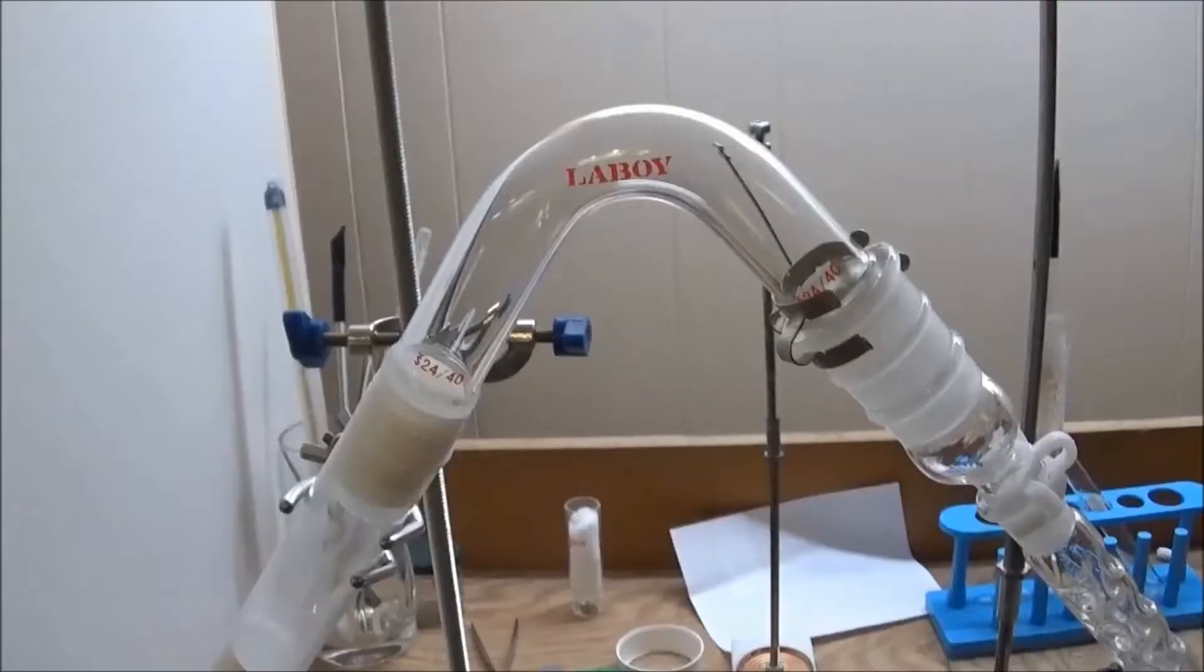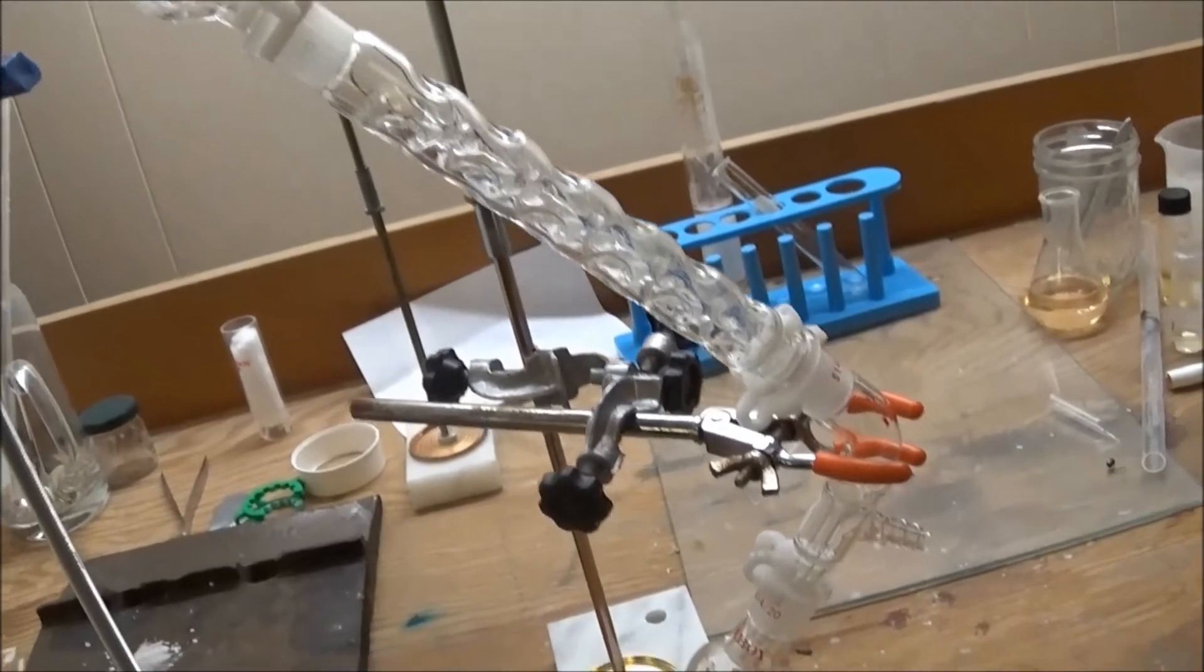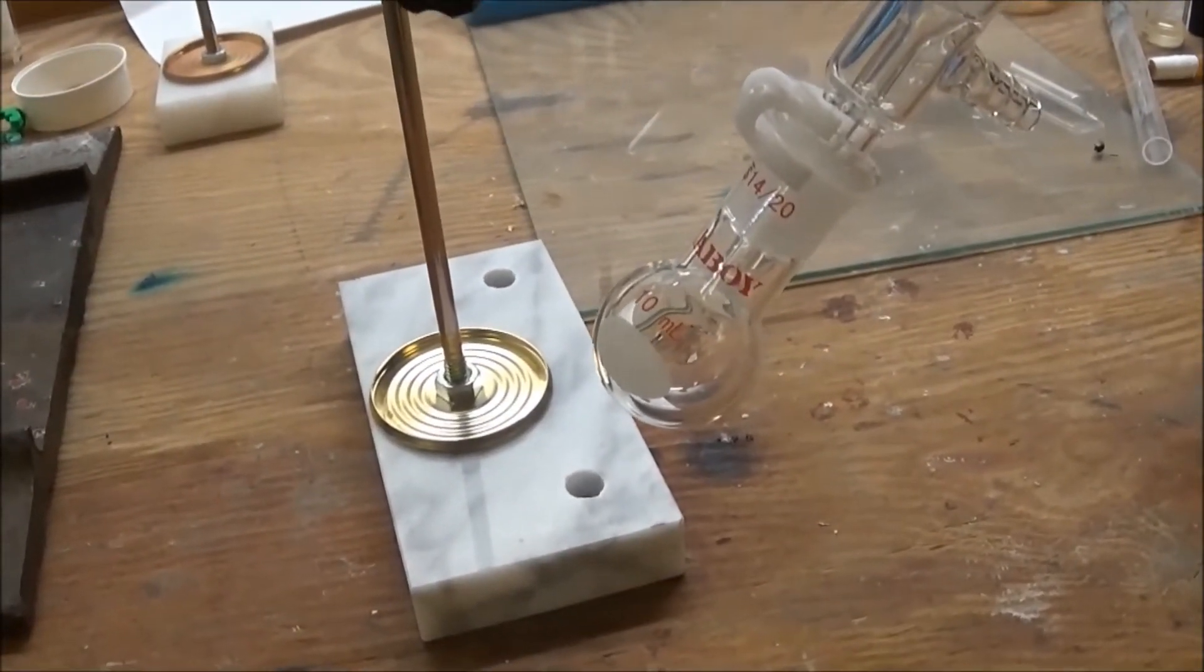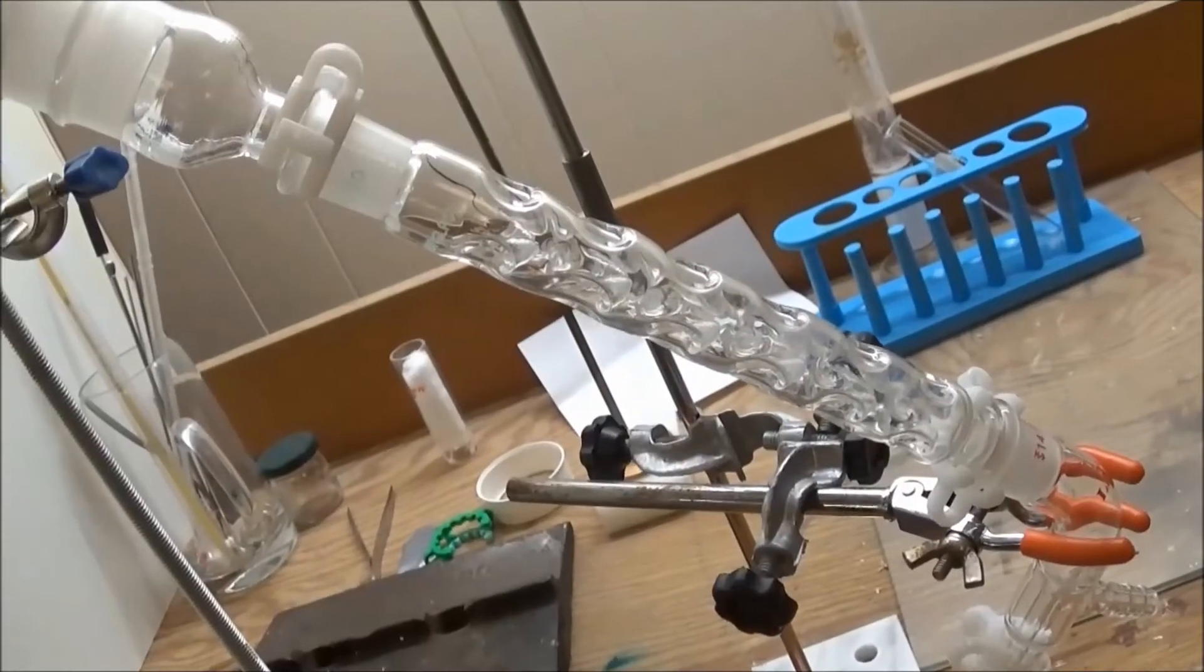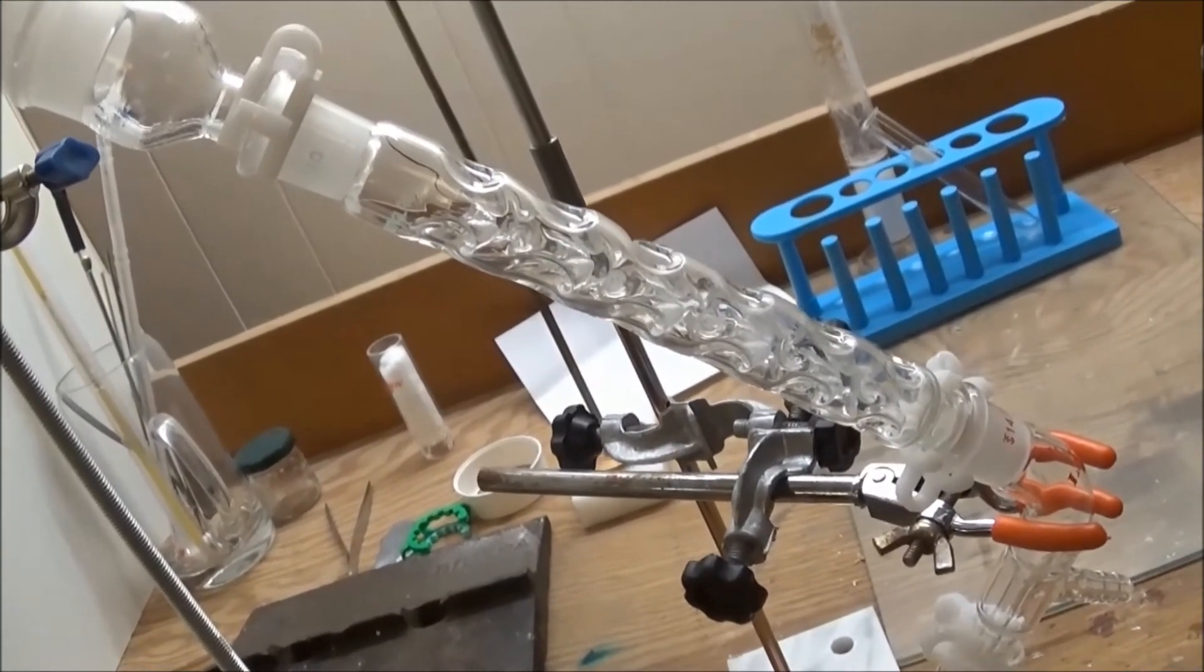This consists of a Vigreux column, a vacuum takeoff adapter, and a receiving flask. The Vigreux column isn't necessary, I just used it as an air condenser. A water-cooled condenser would work even better.